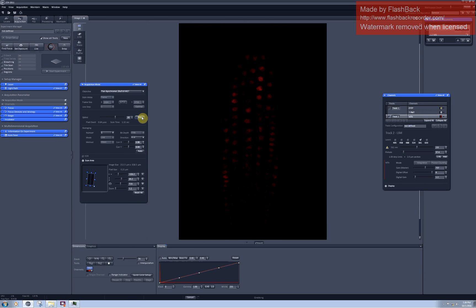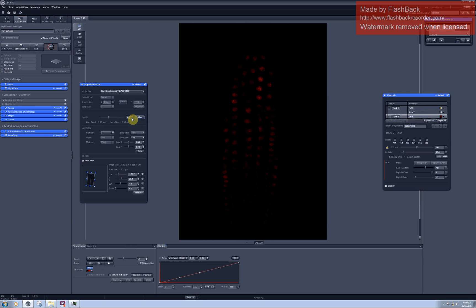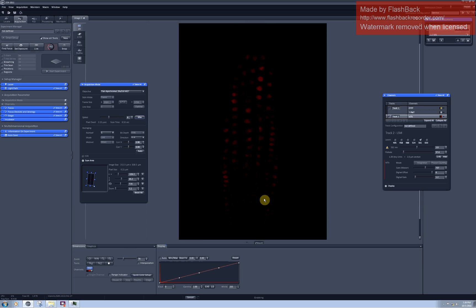If I switch from maximum speed of scanning to slower speed of scanning I gain quite a lot of information in darker areas, so this would be beneficial for scanning this particular sample.